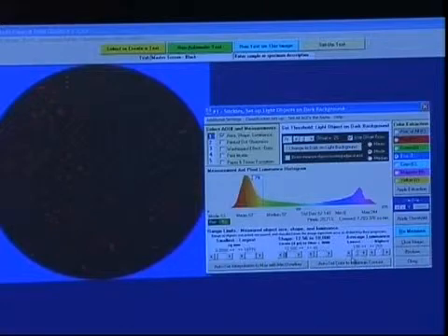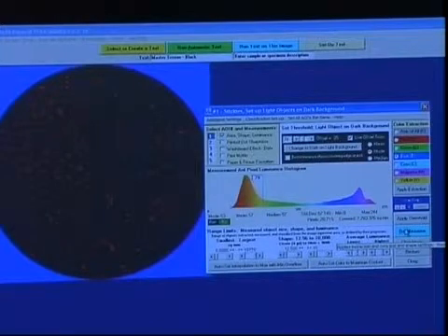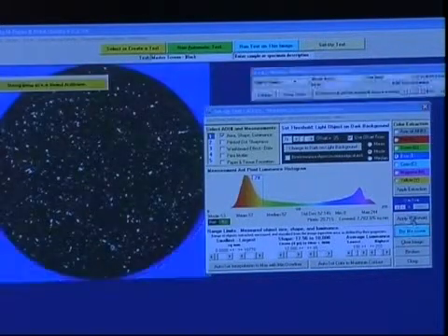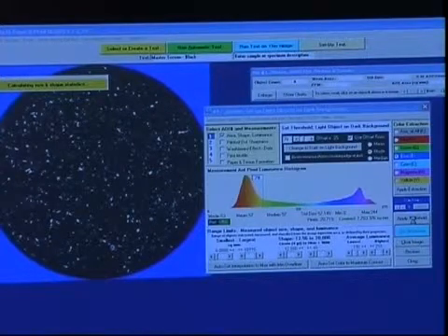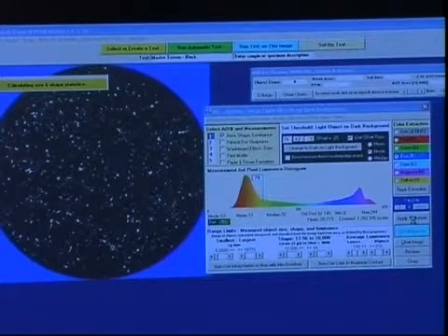And for the average luminance, we want only the white materials. So we'll set the range to be 130 to 255. And this will do the stickies. As before, we'll do the measurement very quickly. It will give us the same report that we had in dirt, a little bit more sophisticated because now we're reporting luminance also.